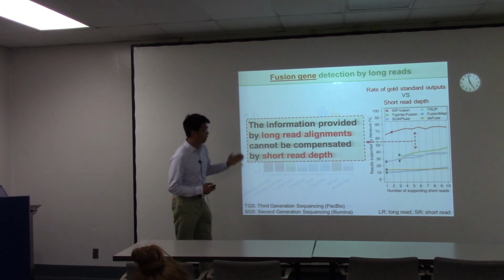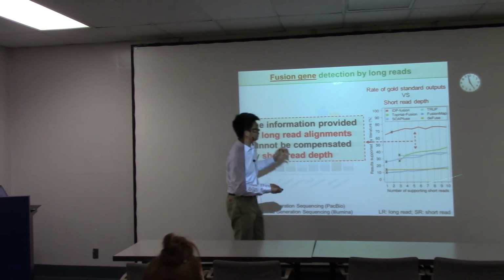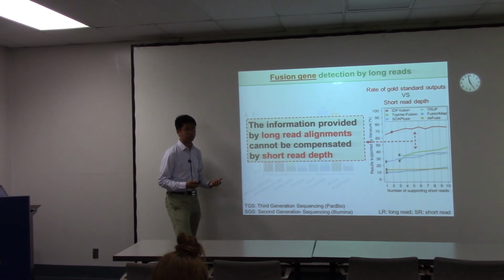Because we have long reads, and long reads give you very reliable, very valuable and exclusive information that short reads cannot give you, even if you increase the number of short reads.